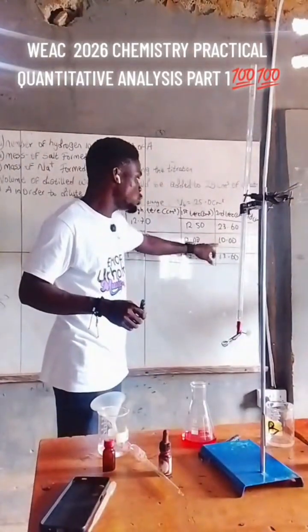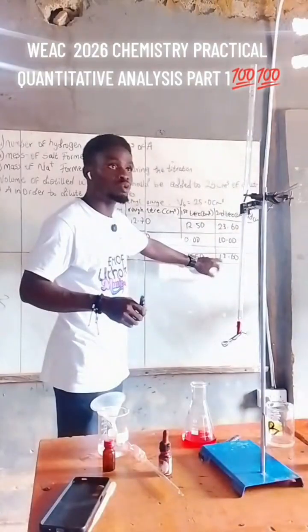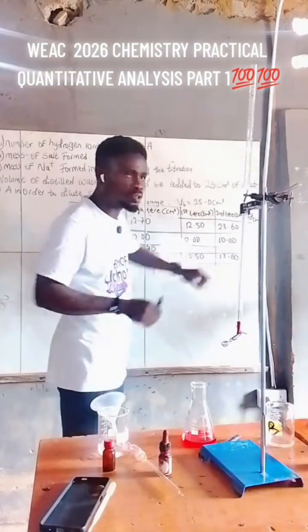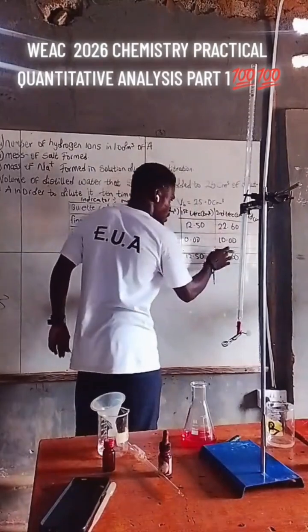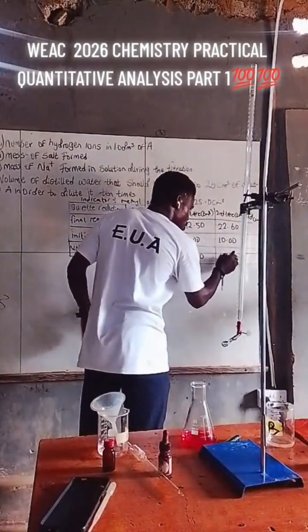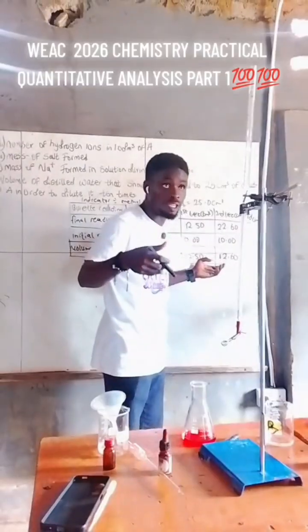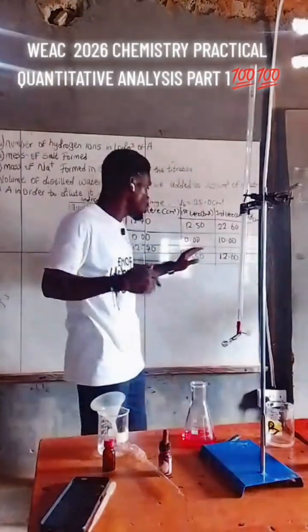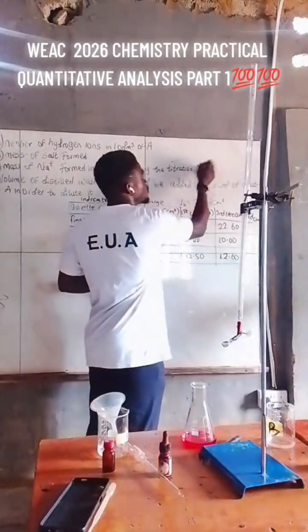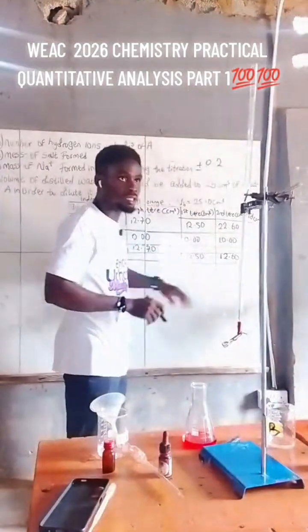So at what value should this give us around 12 point something? 22 point what? So that has to be 22.60, right? What will it give to me? 12 point what? Mind you, they should be concordant, not too far from each other. So you have to learn to reconstruct your titration so that it does not go plus or minus 0.2. Okay, is that clear?